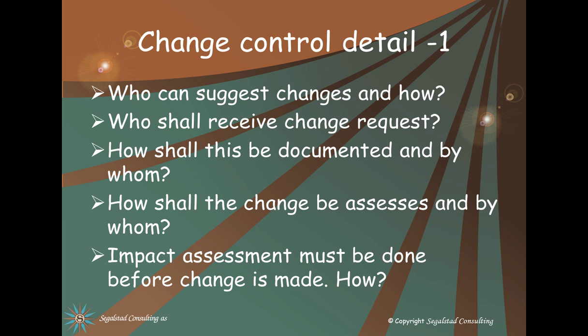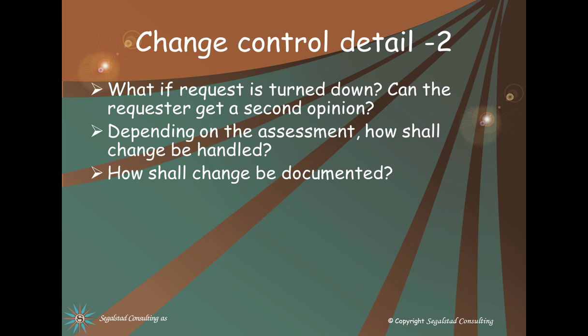A little bit about the change control in detail. What do we do? Who can suggest changes? Who can receive the change request, and how shall it be documented? How shall the change be assessed and by whom? And the impact of the assessment. How shall that be documented or assessed for that matter? What if the request is turned down? Can the requester get a second opinion? Depending on the assessment, how shall change be handled and how shall change be documented?